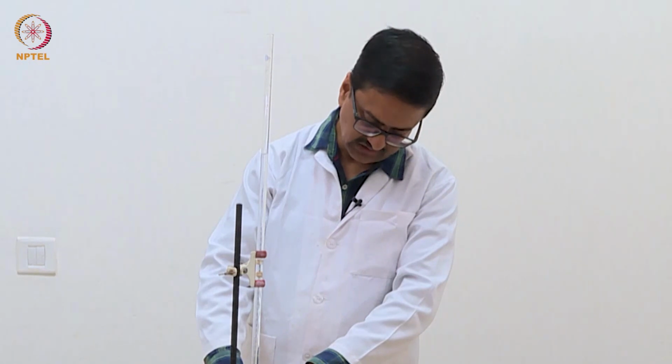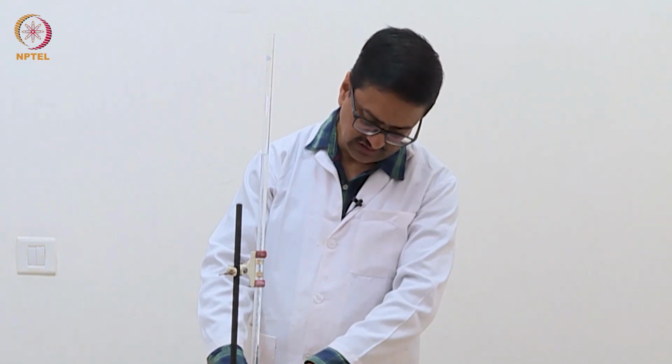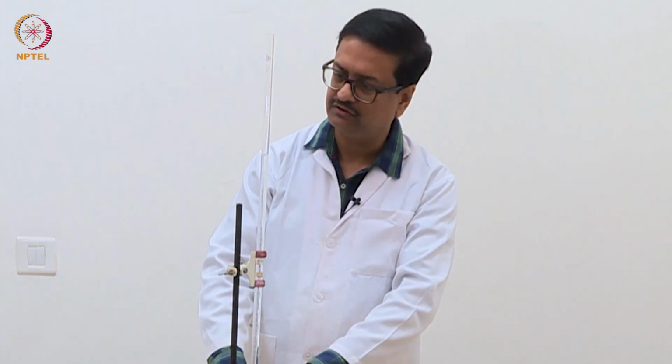See now, on addition, the pink color is staying for a little longer time, which means we are close to the end point of this titration.